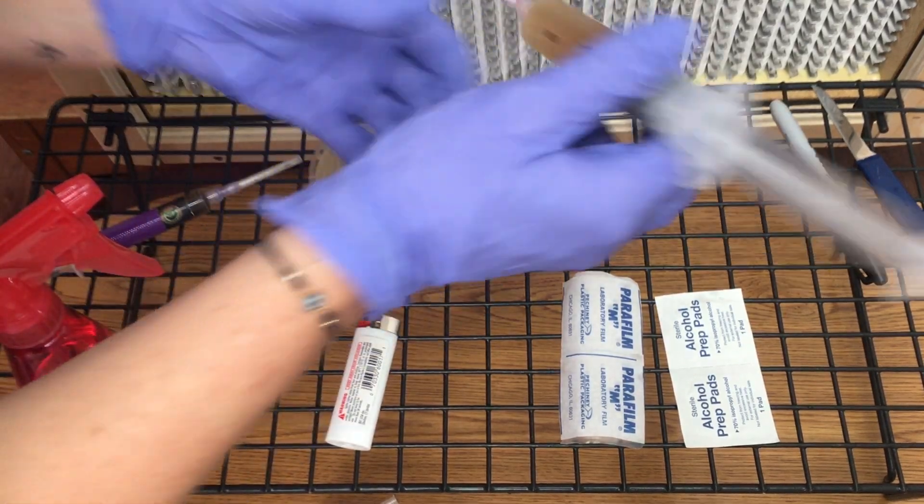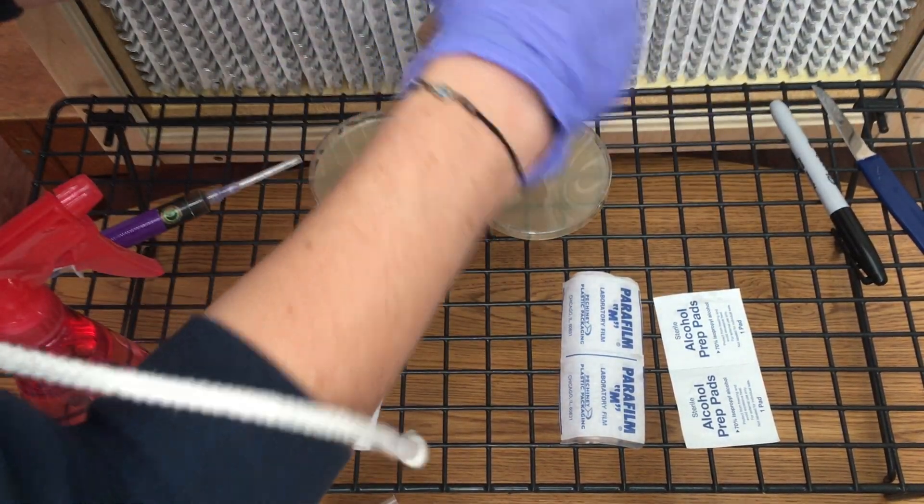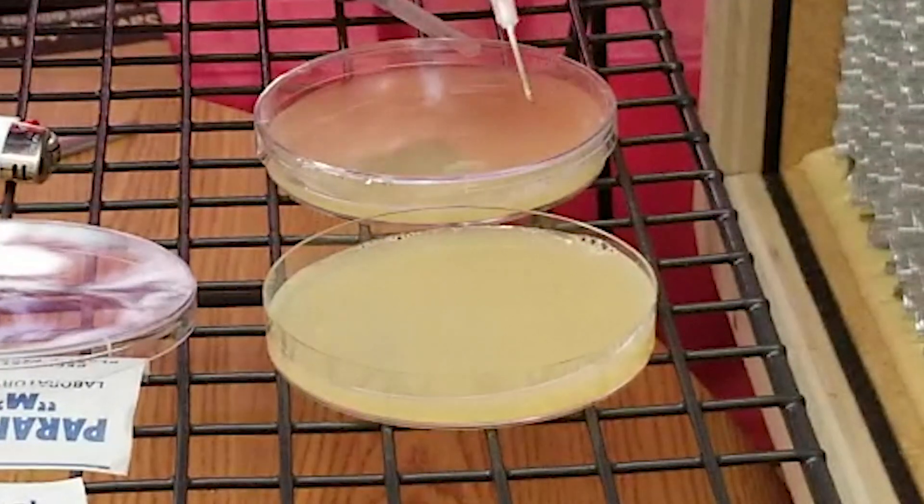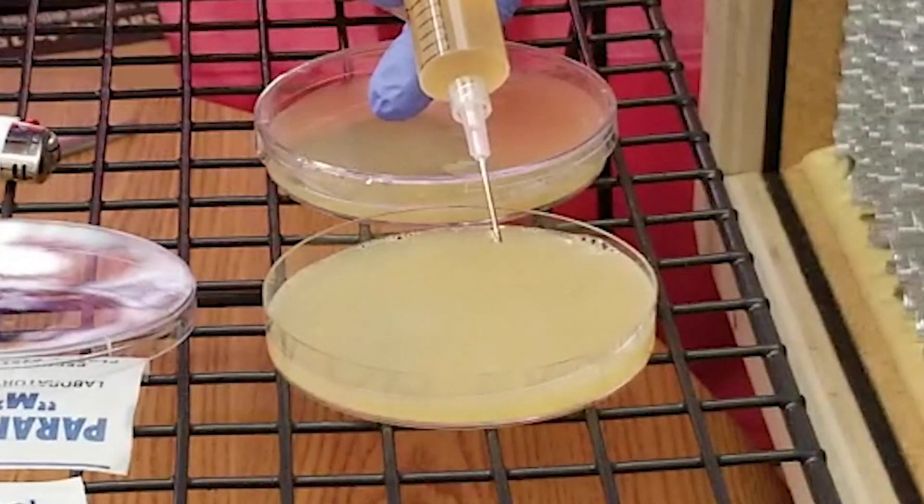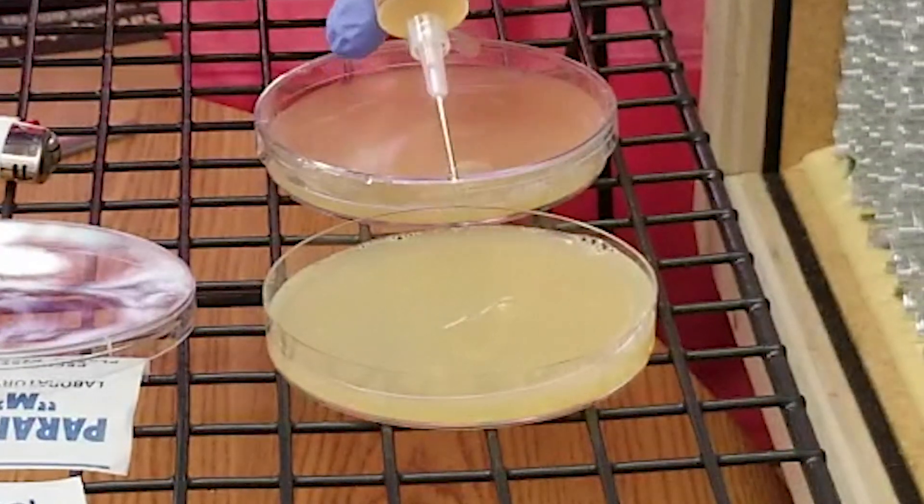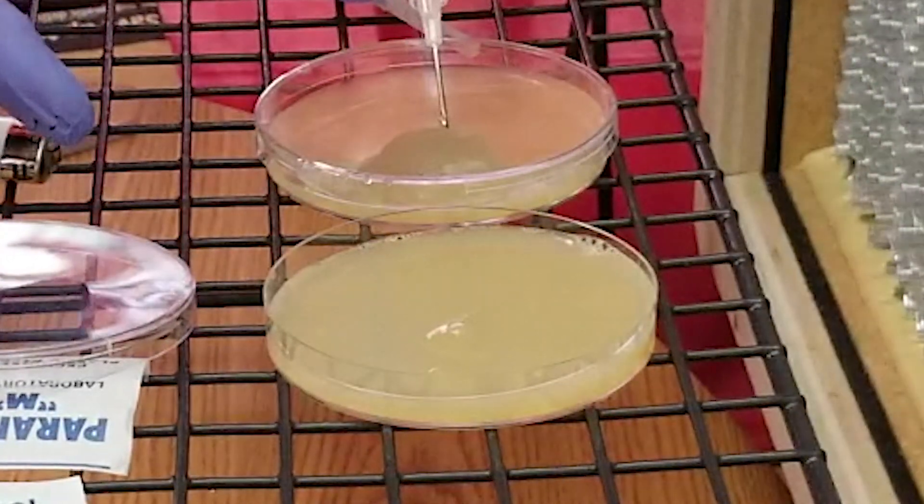Shake the syringe one last time and inoculate your agar by squirting a few drops of liquid spores onto the agar. Like I said, you don't need that much, just a few drops will do and they will spread to the whole entire agar tray.